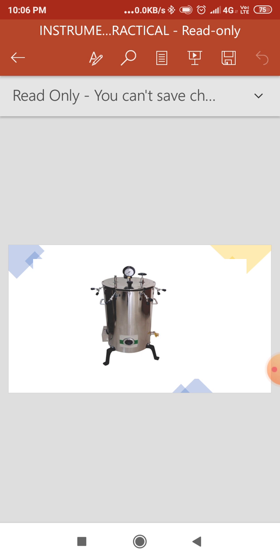There is a lid present, and on that lid the screws are there. You have to tighten that screw when you keep the equipments which you want to be sterilized within the basket or jacket. So here the lid is fitted with clamps, and an asbestos jacket is present. A stationary autoclave may be double door or both ends, one for loading and one for unloading. The pressure gauge is there. The thermocouple for measurement of temperature is usually located within the discharge channel in a dummy article. See here, an outlet is also given, and an air vent to remove the air before sterilization.